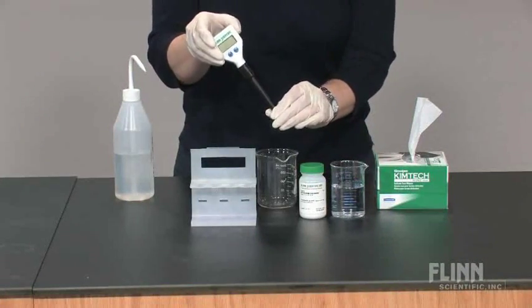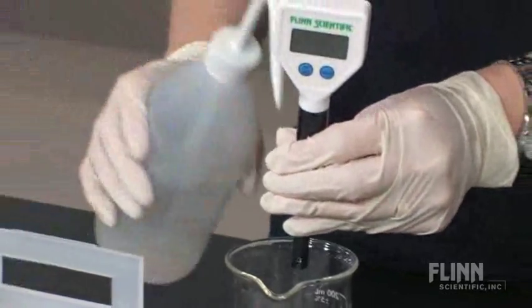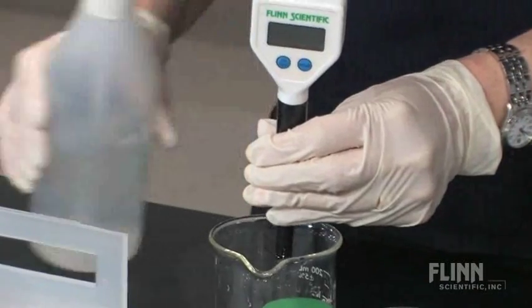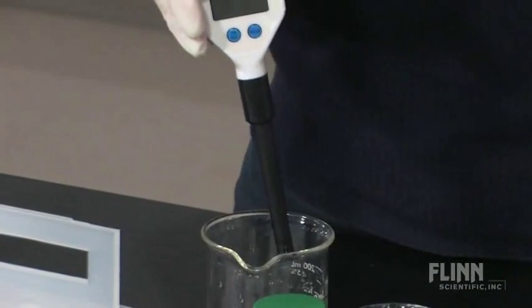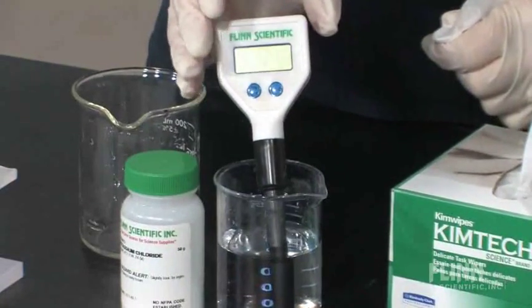If the electrode dries out while in storage or the pH meter reading does not stabilize when taking measurements, the electrode can be reconditioned by soaking it in saturated potassium chloride solution for approximately 30 minutes. At that point, the pH meter is ready to calibrate.